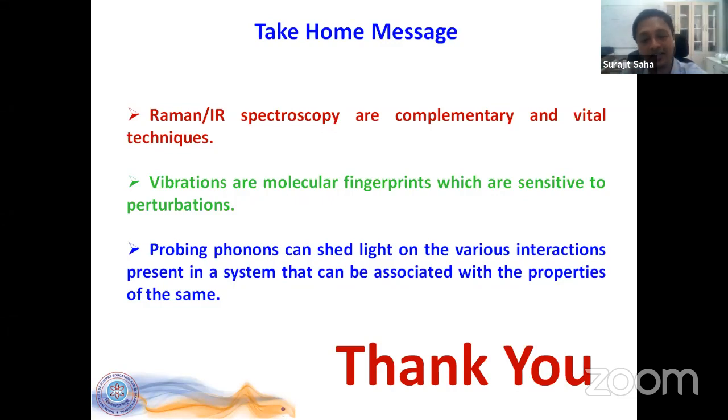But if, let's say, I change the laser and the laser is capable to excite some photoluminescence transitions, then in addition to those vibrational modes, I might also see photoluminescence transitions in the spectrum. And that's when, again, the spectrum will change. So these are different conditions when changing the laser may change the spectrum. But as a ground state, if I say in general, the Raman spectrum should not change unless there are these and other conditions involved in the sample.